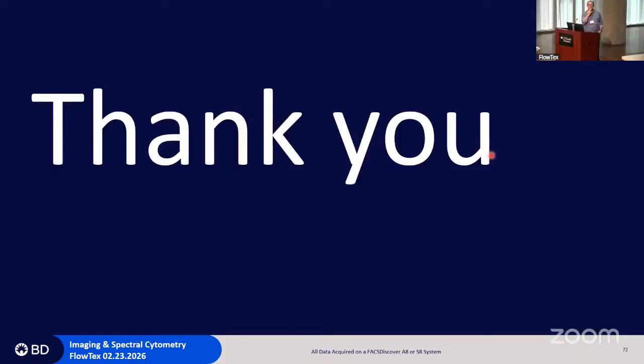That was a really nice talk. Two questions for you. When you first do the image analysis, you have all these different characteristics that you can look at, right? And then those are what you can also put into FlowJo later to do the batch. Can you export the images completely out and still keep that image ID, in case I want to do something like what EM does for class averaging, or do more traditional image analysis segmentation?